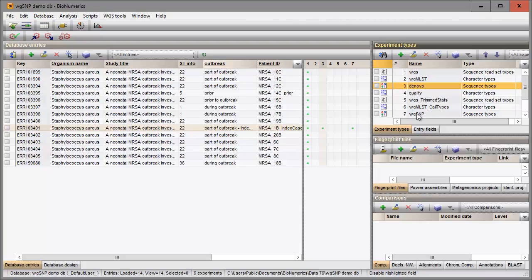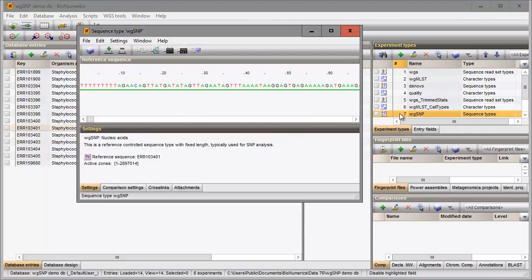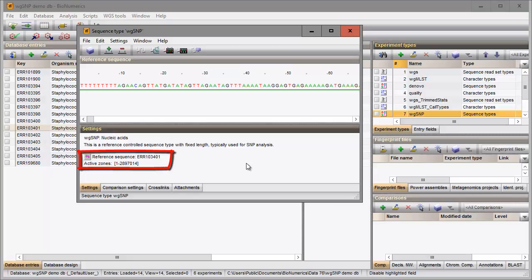I double-click on the whole genome SNP sequence type experiment to verify this. The reference sequence is indicated in the settings panel.